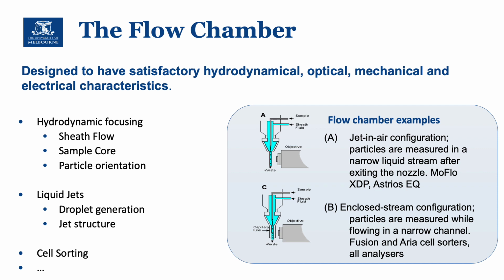Now the heart of the fluidic system is the flow chamber. And the flow chamber is specially designed to comply with several properties, including hydrodynamical, optical, mechanical, and electrical characteristics. So particles are typically injected into the flow very close to the flow chamber or within the flow chamber.